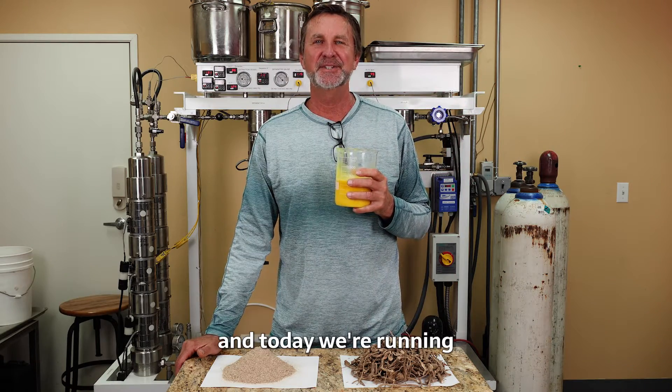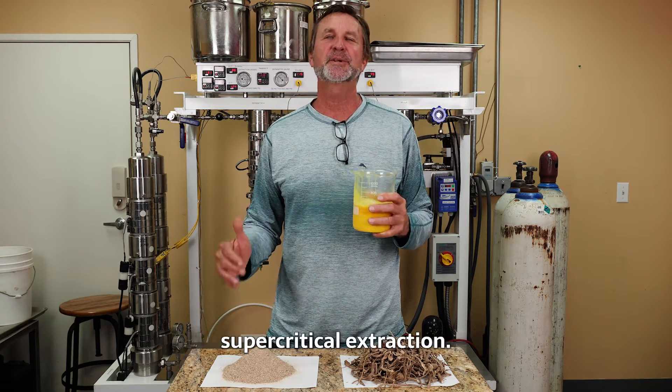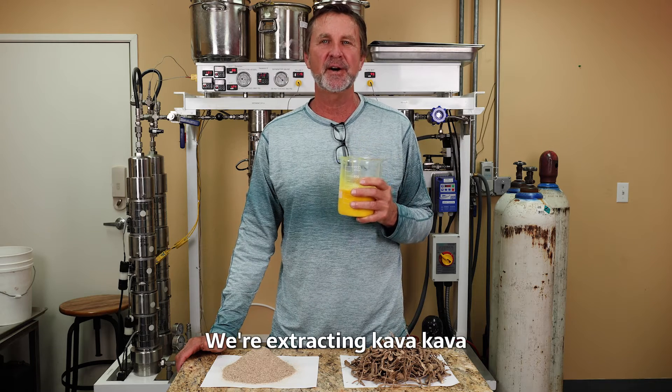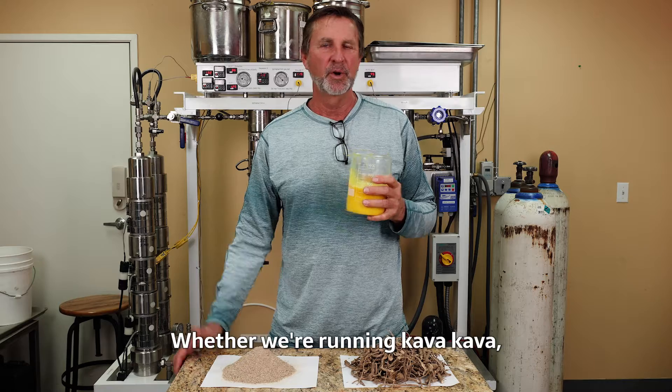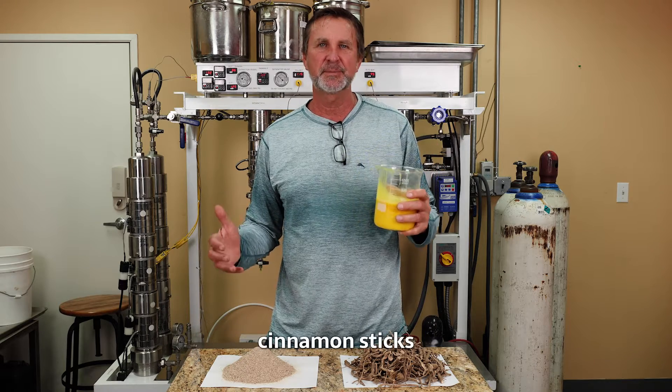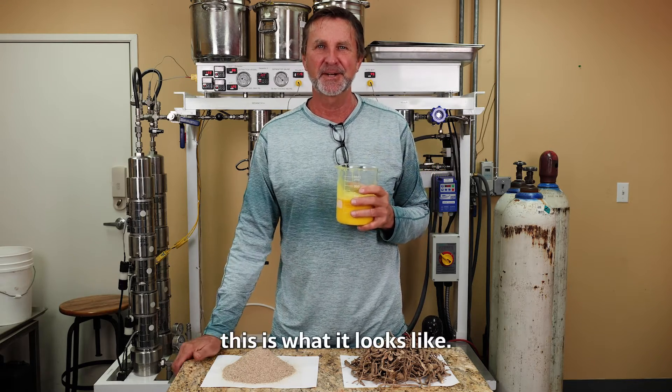Hi, Bill the Flavor Guy here, and today we're running supercritical extraction. We're extracting kava kava, and we're going to show you that process from start to finish. Whether we're running kava kava, cinnamon sticks, or vanilla beans, this is what it looks like.